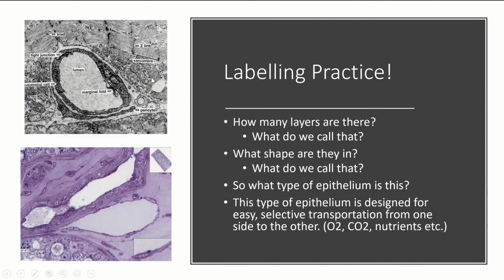Okay, so we'll go to our next one. So this is an EM, so remember, this is much more zoomed in than it is right here, but here you can see a nucleus, and all of this is the cytoplasm of that cell. Okay, and then it's touching another cell somewhere here or here, and there's another cell that's very flat.